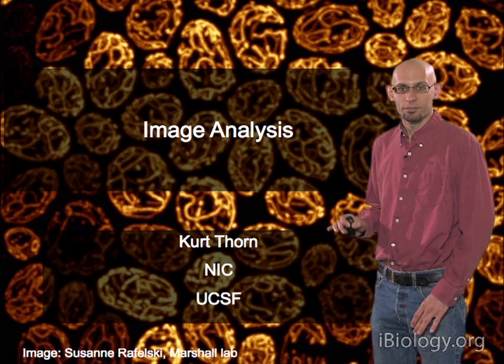And so here's an actual PSF. So here's a point spread function measured from a microscope. And here's that Gaussian kernel again. And you can see they do look fairly similar. And in fact, if we took a little bit bigger Gaussian, it would be an even better match to this. And so the idea is that this is a good approximation to the underlying distribution that our microscope generates. And so smoothing by this will remove any sort of nonsensical hot single pixels or bright single pixels that couldn't have come from a real object, which would instead generate a bright thing that looks like that.